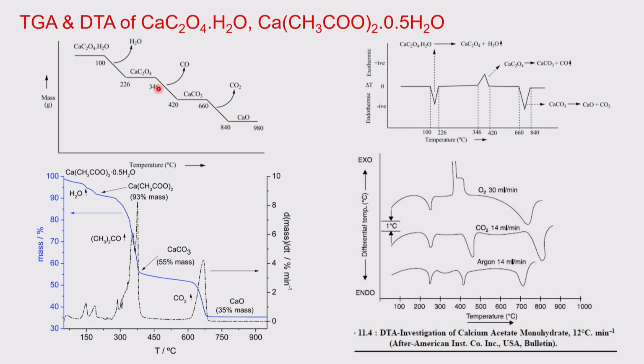Now this oxalate spontaneously breaks down, or carboxylate is also not a wrong thing. When the temperature is raised to around 225 till about 350, as you keep increasing the temperature you will start breaking it, and this is the exothermic process. So that gives calcium carbonate plus CO. Then the calcium carbonate that is formed now breaks down to calcium oxide plus carbon dioxide, but this requires energy, because that lattice requires to be broken, whereas the first happens in a spontaneous way with the temperature. So that process is exothermic and this process is endothermic.